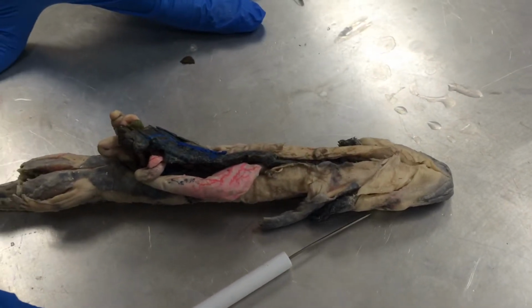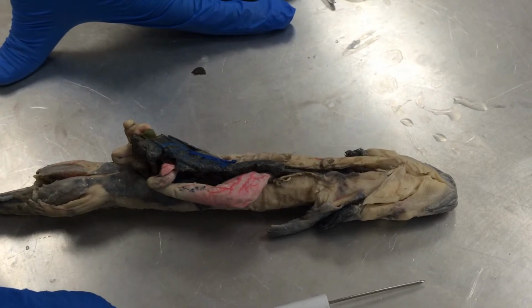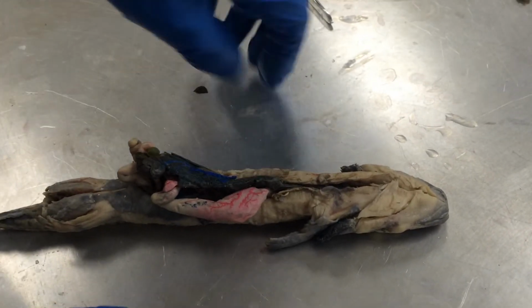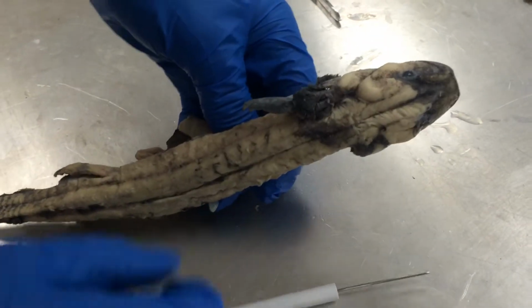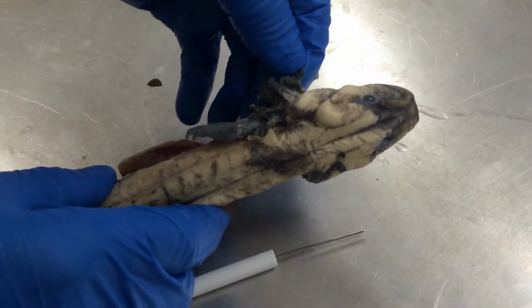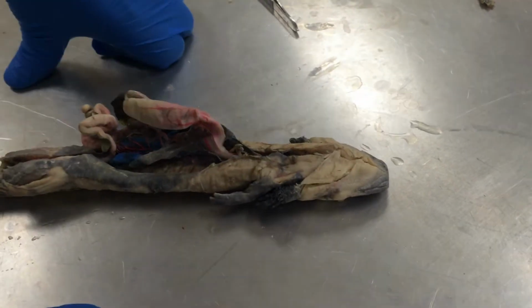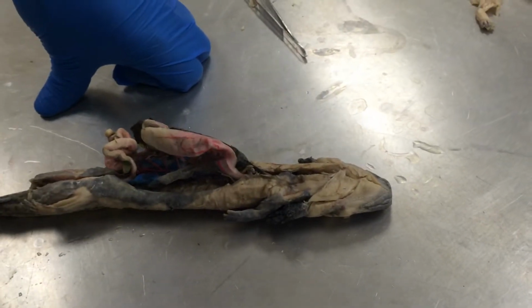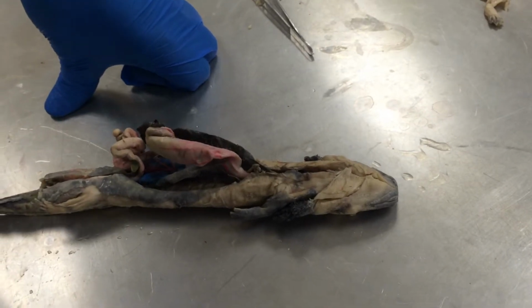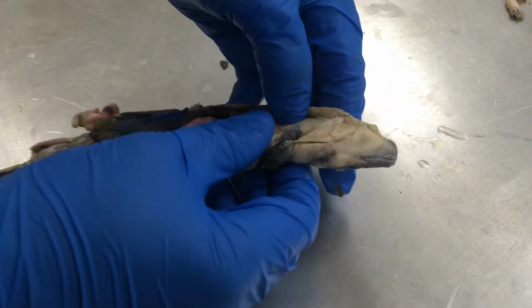The most obvious organs of respiration in Necturus are three pairs of bushy external gills, located at the posterior boundary of the head. Recall that the gills in the shark are internal, associated with the gill pouches and gill slits. Notice the tremendous vascularity of the gill filaments in injected specimens.